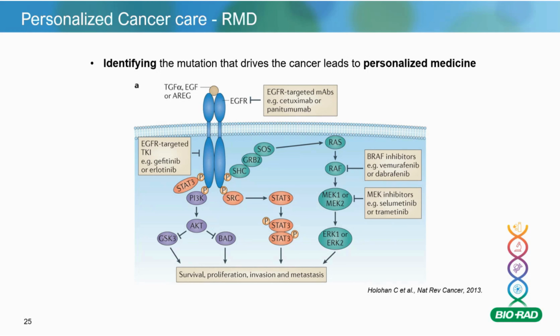And if we look, for example, at melanomas, around 50% of them have an activating mutation in BRAF, V600E. So that's on the right side here. Now, these BRAF V600E mutations account for around 80% of the melanomas that get these mutations.